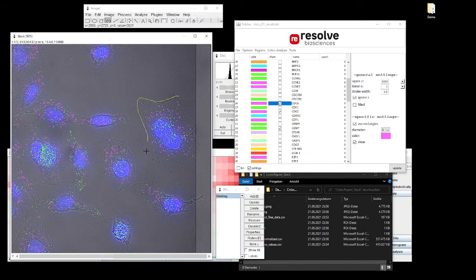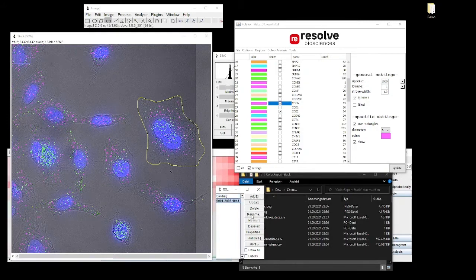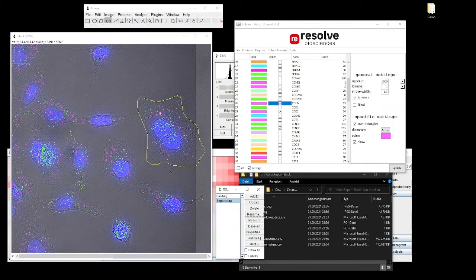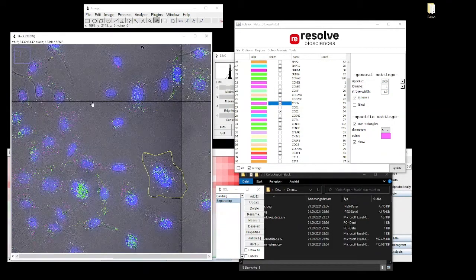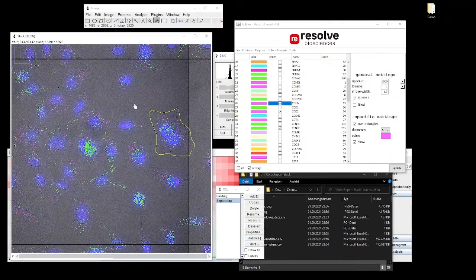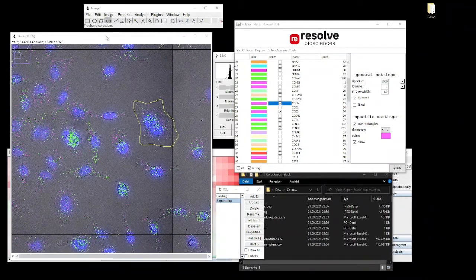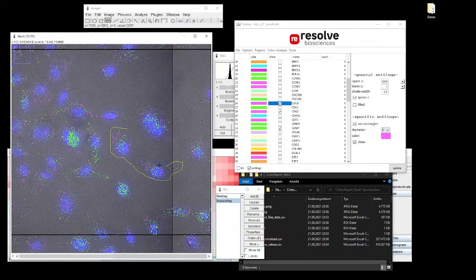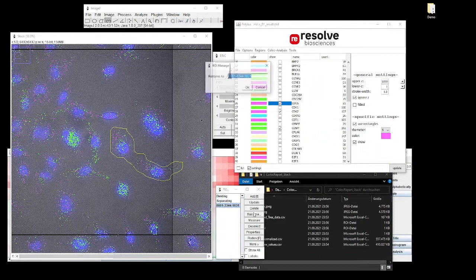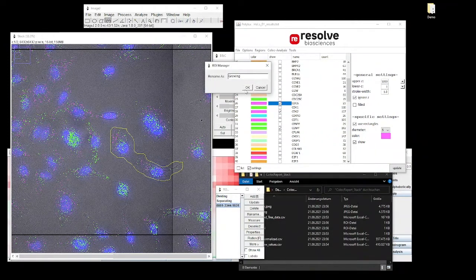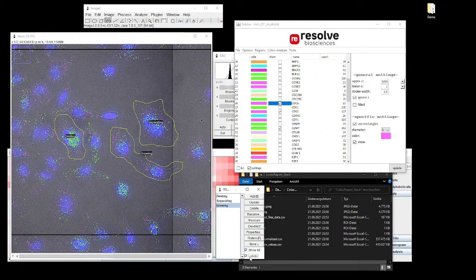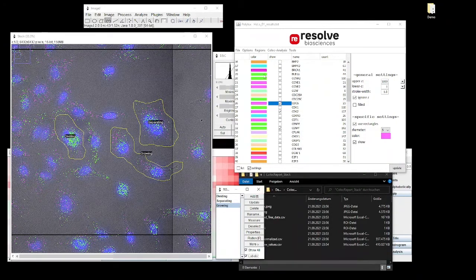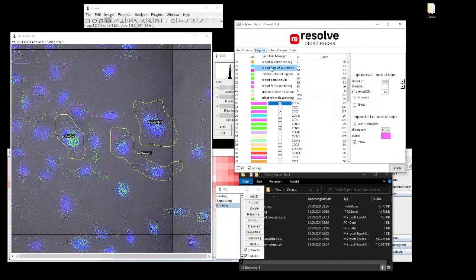This is an example showing how you can draw regions of interest in the tool. It's a freehand tool and the counts on the right side will actually update while we are drawing and encircling the cells. In this example, we have chosen to encircle two cells each. There's two cells that are in the middle of the division process.